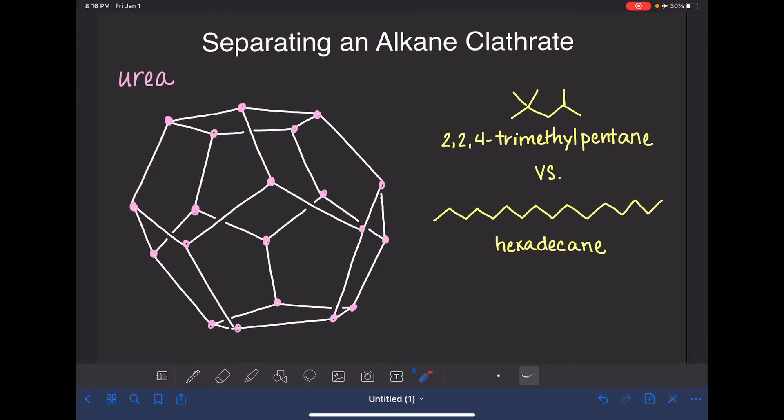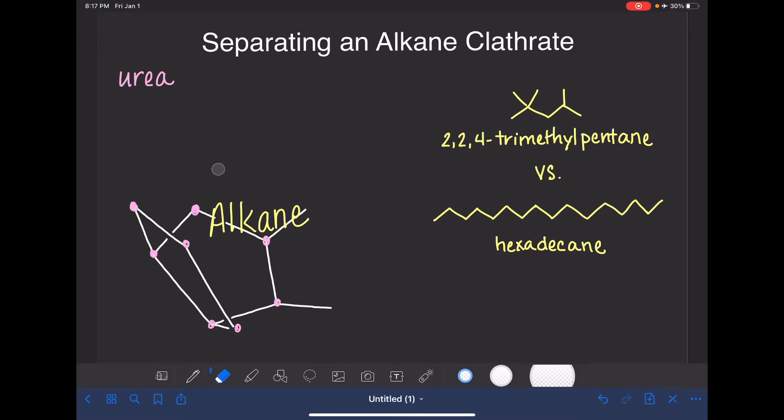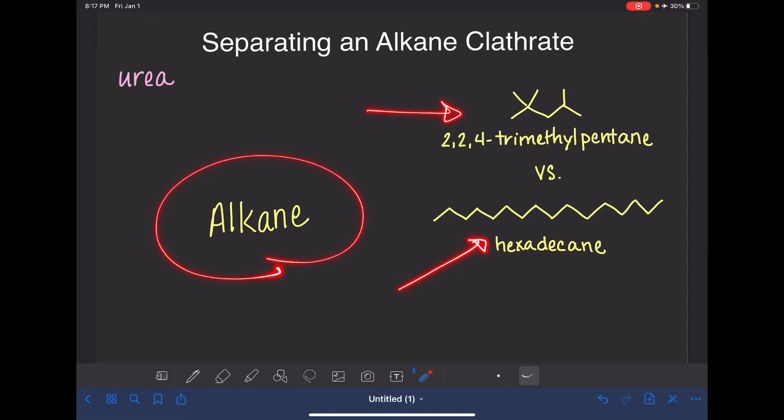It's now time for us to identify which alkane was trapped inside our clathrate. I'm just going to write alkane because we don't know for sure exactly which alkane is trapped in there. So in order for us to identify the alkane that's trapped inside this clathrate, we have to get it out of the clathrate. We have to break the cage. And the way that we do that is by adding water. Water is known to break apart or decompose a urea clathrate. When we add water, it's just going to break apart this whole entire cage and we'll be left behind with just the alkane. Once we've isolated this alkane, we'll be able to characterize it using IR.